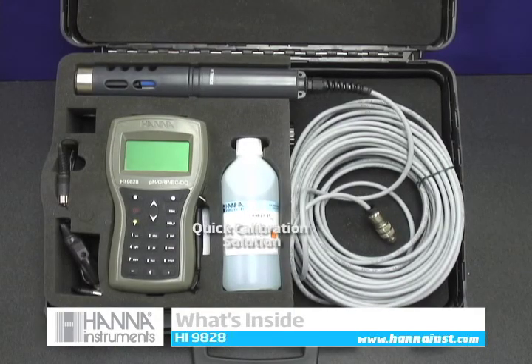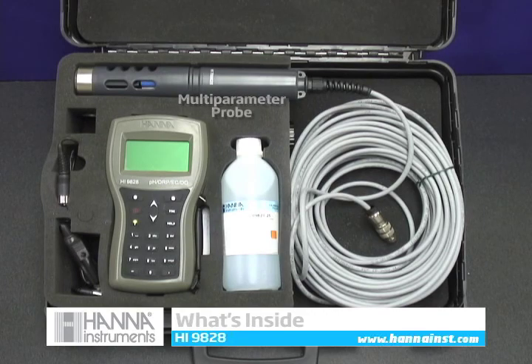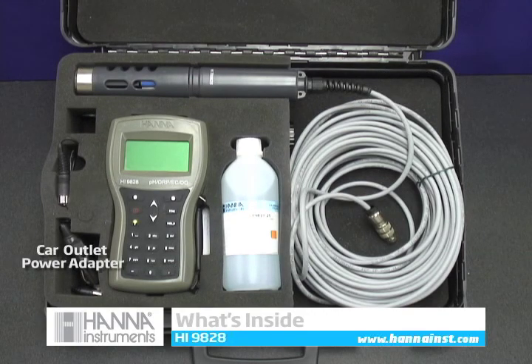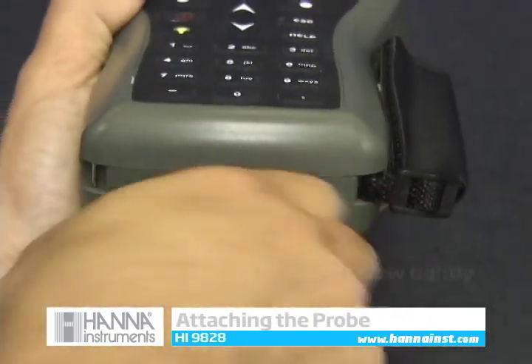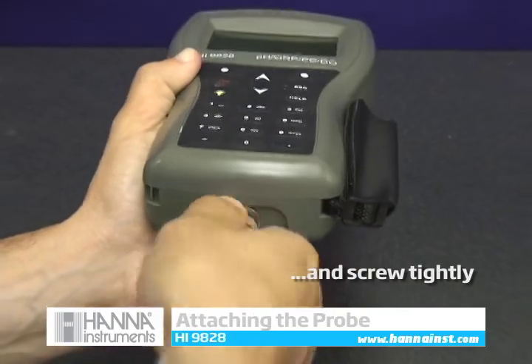Inside the HI9828's rugged carrying case, you'll notice the accessories neatly stored along with your instrument and probe, including a bottle of our quick calibration solution. To get started using your HI9828, attach the probe's connector to the bottom of your meter and screw tightly.